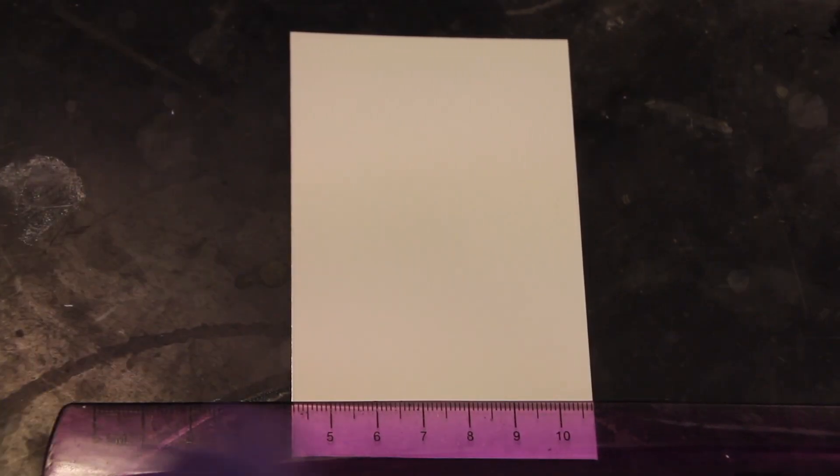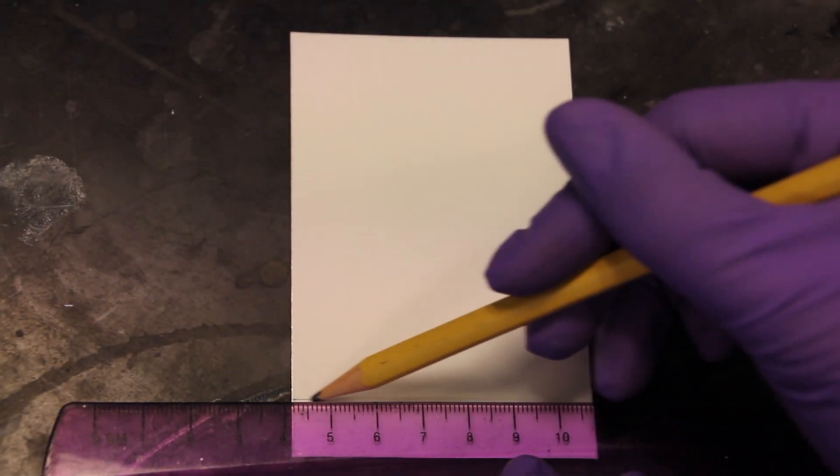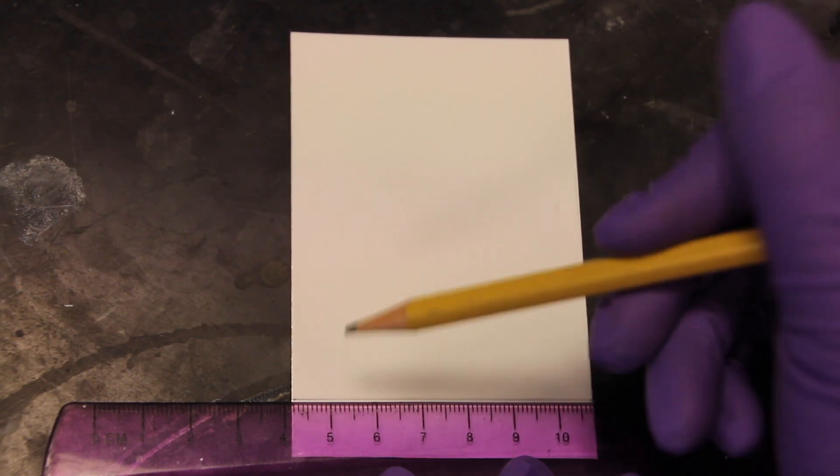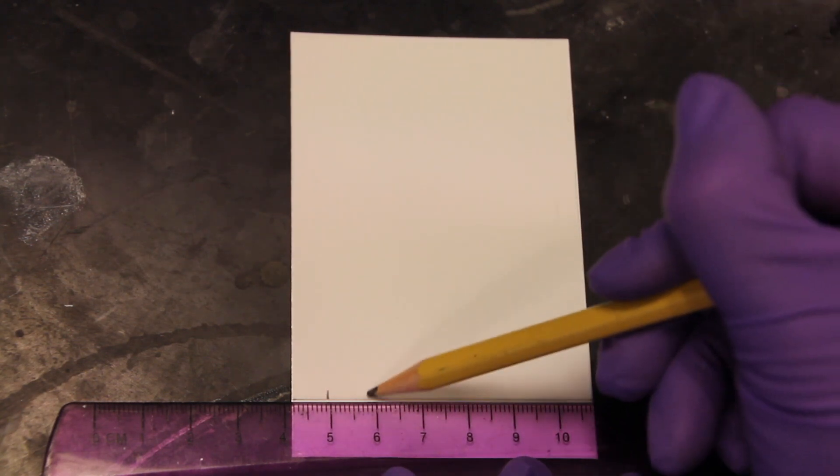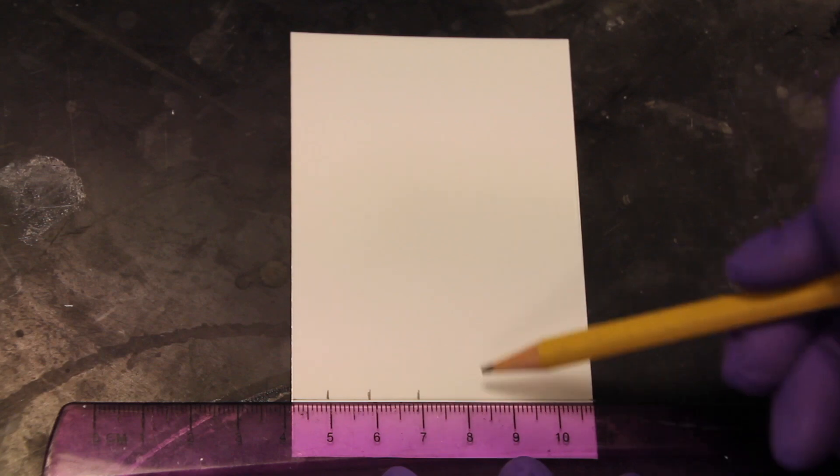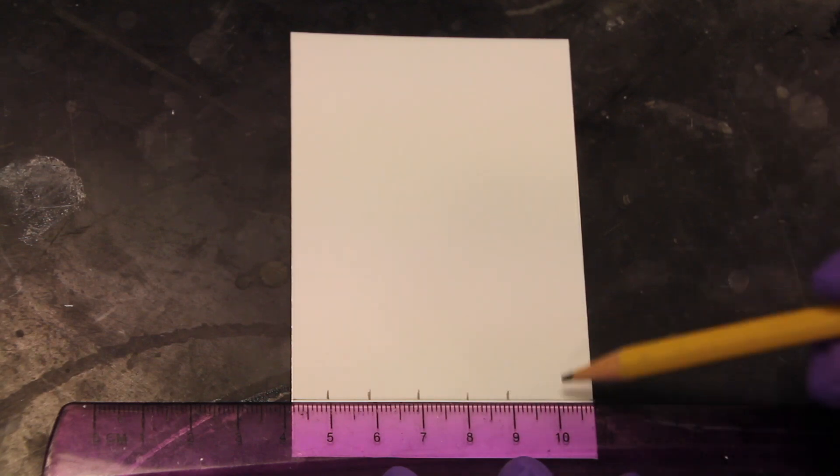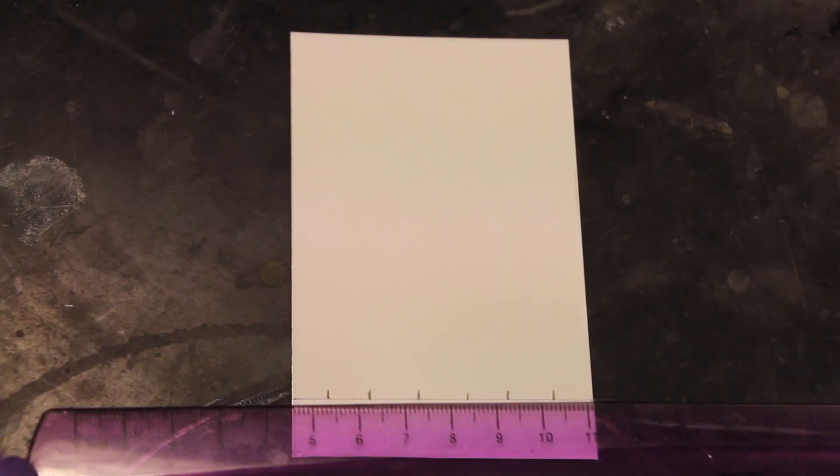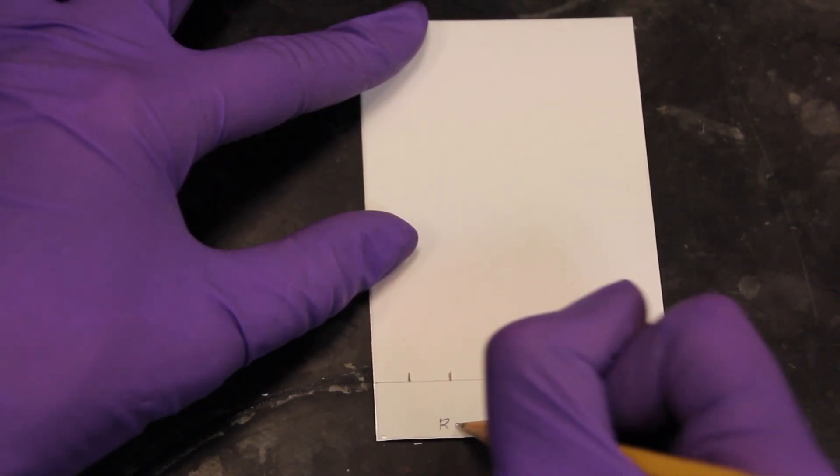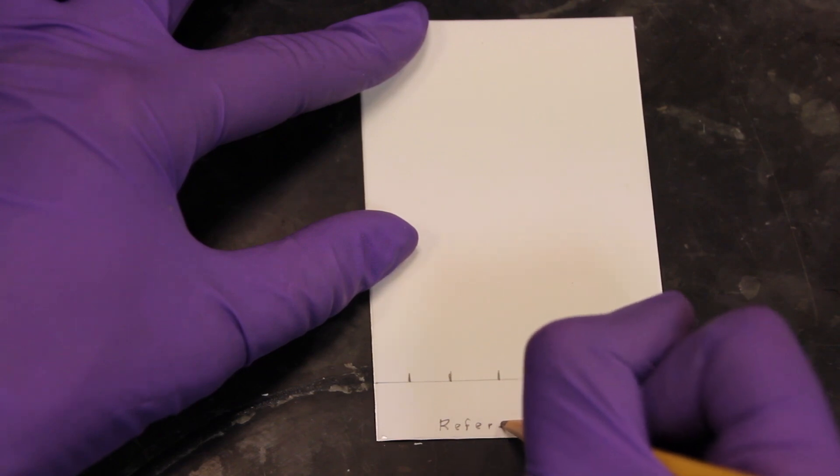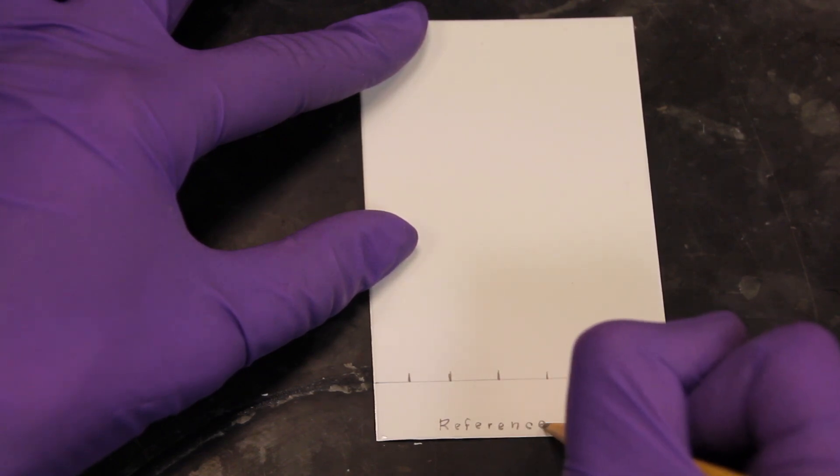To prepare your TLC plate, begin by using a lead pencil to lightly draw a line across the width of the plate, making it at least 1 cm from the bottom. Do not disturb the silica gel coating while doing this. Next, use a cm ruler to mark off 6 spots on this line at 1 cm intervals. The first spot should be approximately 0.6 cm from the edge. These points will be a guide when spotting the samples.